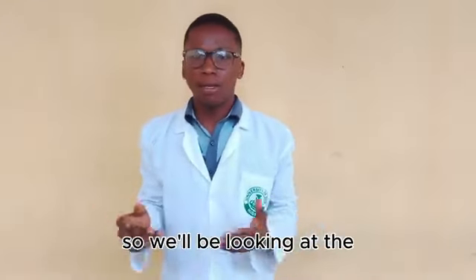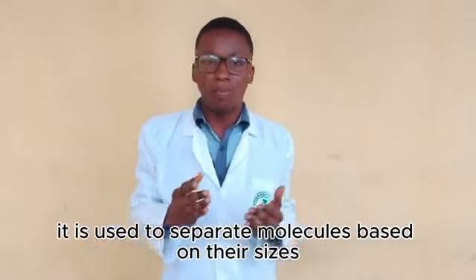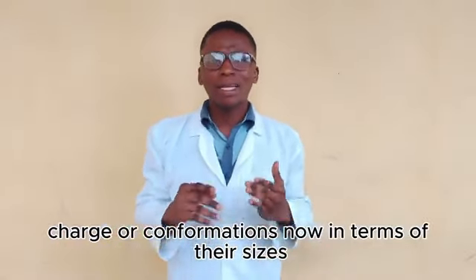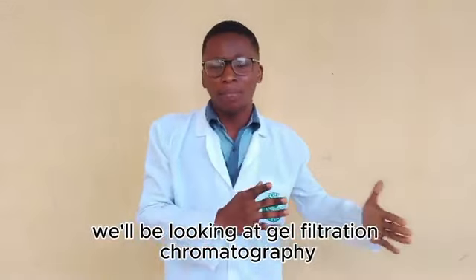So we'll be looking at how polyacrylamide gel electrophoresis is used to separate molecules based on their sizes, charge, or conformations. In terms of size, we'll be looking at gel filtration chromatography.